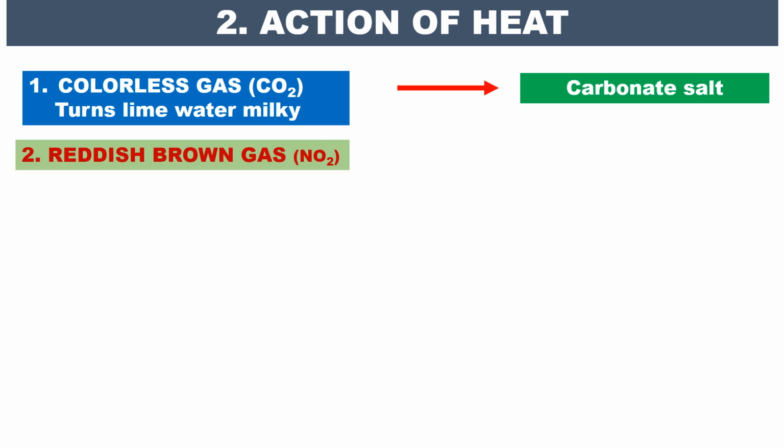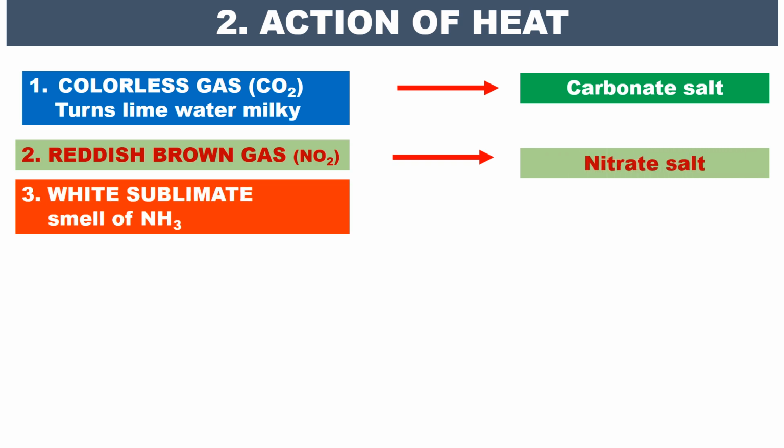Now, if a substance gives reddish brown gas, then it is due to NO2, and it shows the presence of nitrate salt.